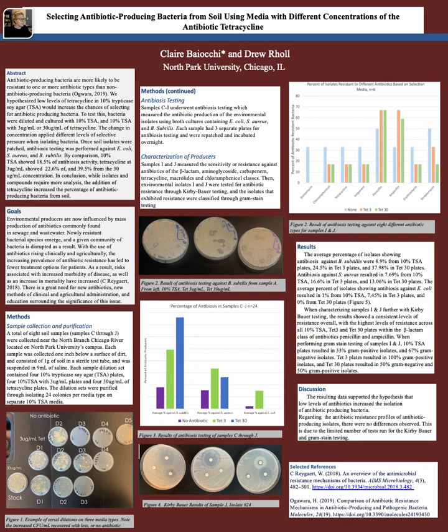Hi there, my name is Claire Baiocchi, and my research with Dr. Drew Roll related to selecting antibiotic-producing bacteria from soil using different concentrations of tetracycline.